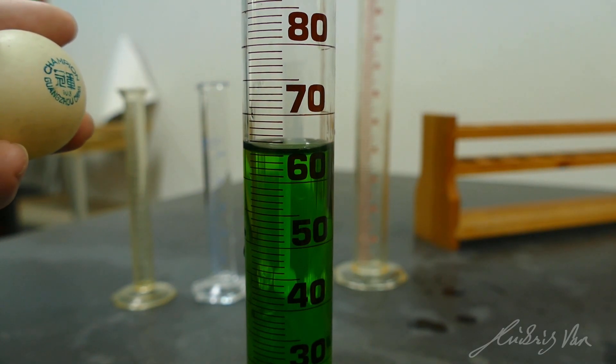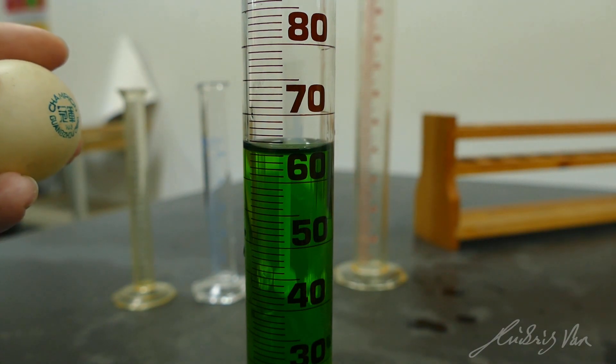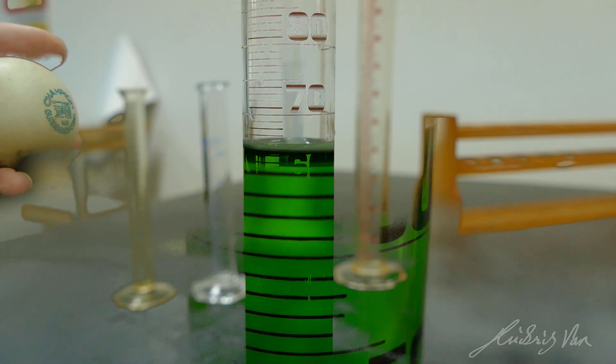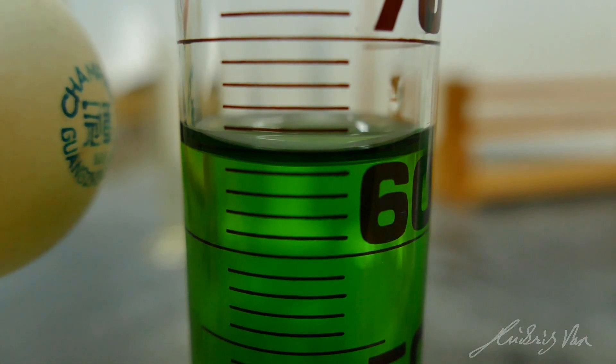Then you can just add it drop by drop to see whether it increases until 65. Now, just make sure that you are reading it from the meniscus — that means the bottom. So let me just add a bit more. If close by, your eyeball should be at this level.